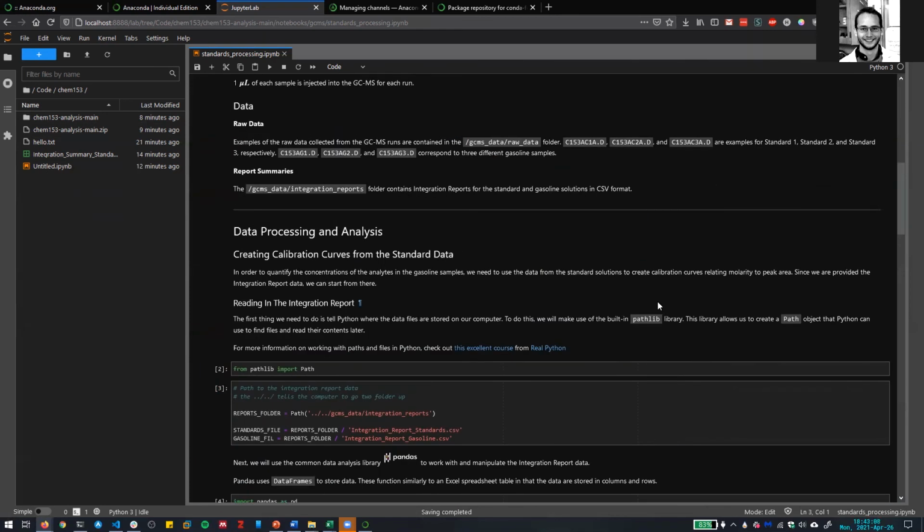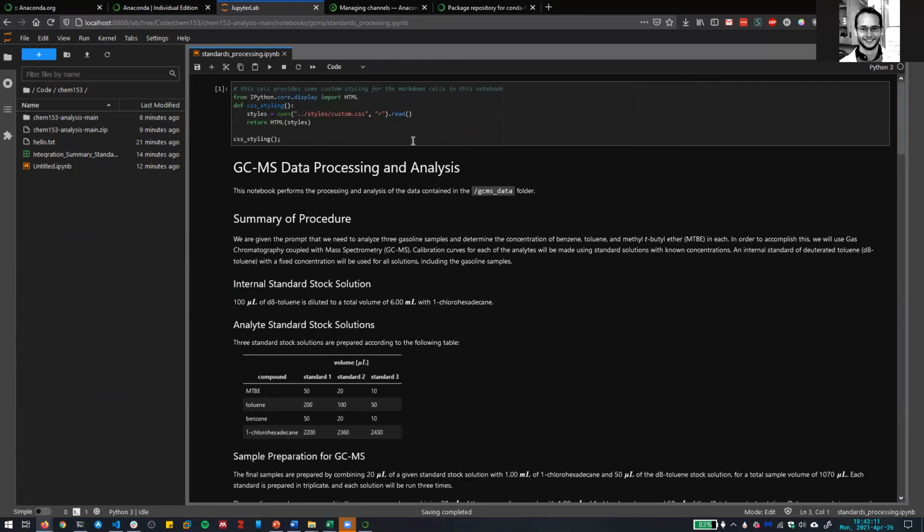Okay, so another thumbs up. Who has been able to open this notebook file and run at least this first cell? Great, we've got a couple people. So those of you who have not been able to get here yet, are you still just installing packages and waiting for Jupyter to open up? Or Lily, did you finish your install of the installer yet, or your download of the installer? Still installing. A couple people still installing.